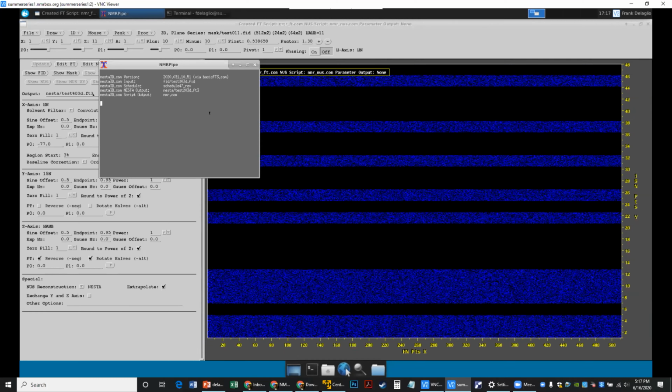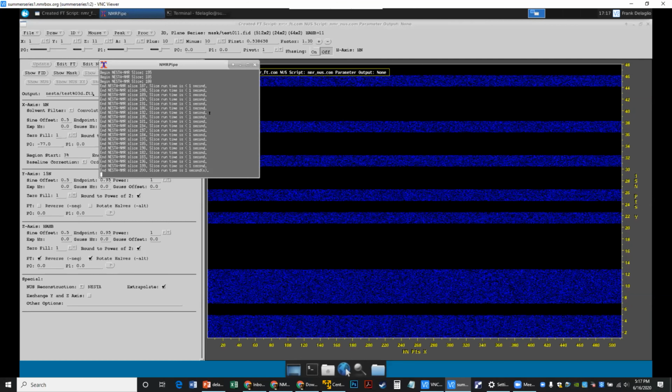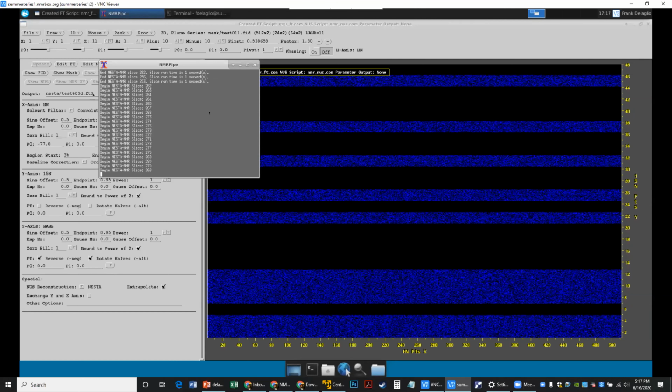That might be cruel. No, maybe not. I actually don't think so. I think the results are quick and pretty nice. It's nice to see it run, though. Thank you. I mean, it runs here too, but it's nice to see it run in the box. That's very cool. 10 seconds, 18 seconds, not bad, huh? Yeah, not bad. I'll take that. If I use my IST, it'll probably take 15 minutes. That's very good. That just reminds some of us about how slow processing used to be.